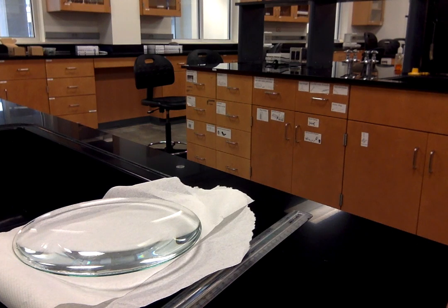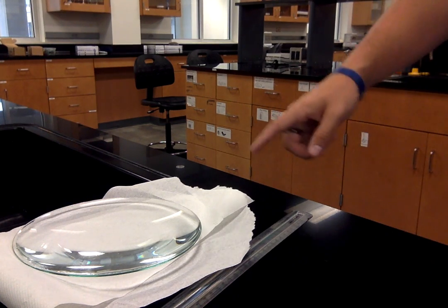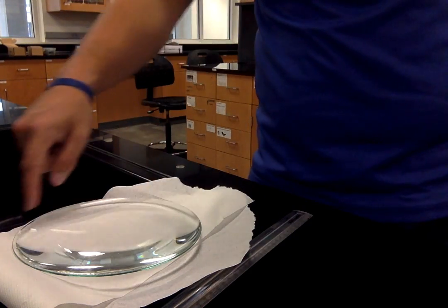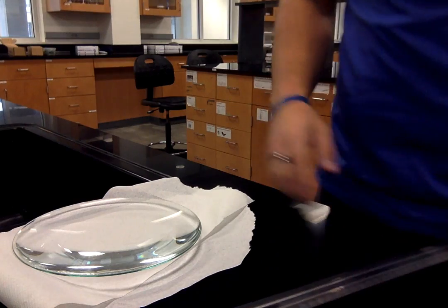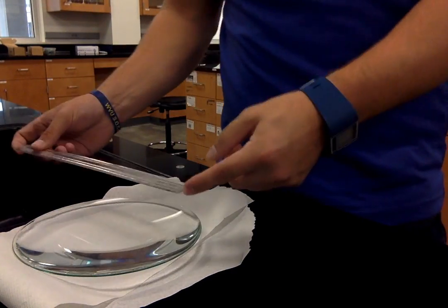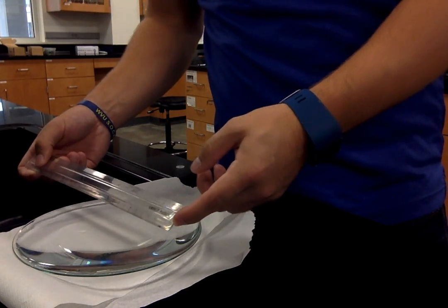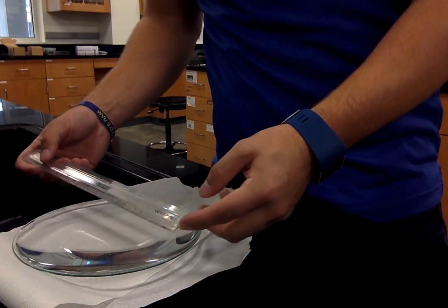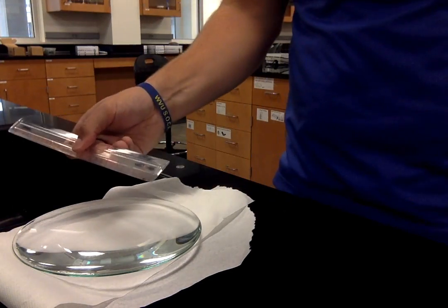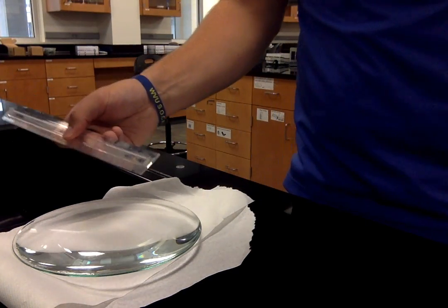And you're going to create a monolayer. So what I did is I put a watch glass and filled it with water, so you can see that it's covering the entire surface of the watch glass, and you're going to measure the diameter of your watch glass in centimeters. So when you're looking at it, there's inches and there's centimeters. You're going to measure the diameter of it in centimeters.